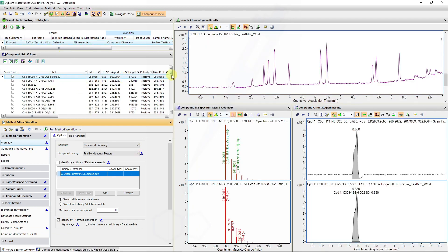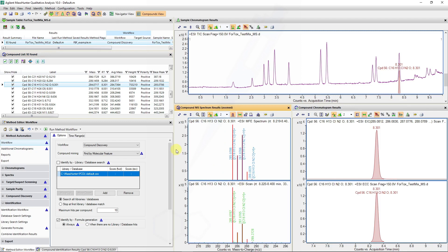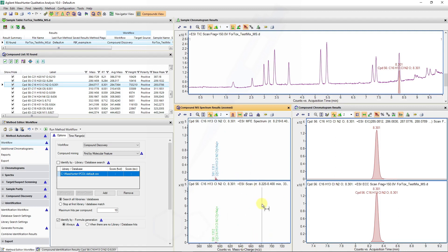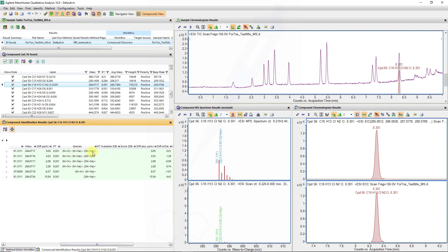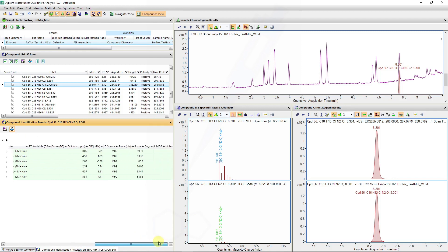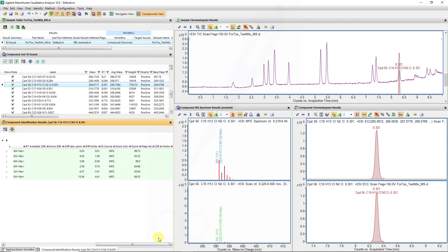Of our 93 compounds, I now want to go back to my diazepam peak at 8.3 minutes. You can now see it's predicted and proposed the formula for our diazepam molecule — in this case proposing that there is a chlorine. Looking at the different adducts, they have also been proposed with the same formula. The formula results can be seen ranked in the compound identification results, with ppm mass error and scoring ranked by how well the formula fits on those different charge carriers.